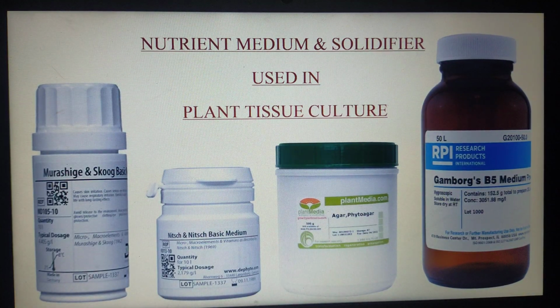And these are the images showing the different types of media. Instead of preparing the medium ourselves, because only a skilled person can prepare the medium at a proper level and in a correct manner, we can collect the medium from the market, and we can simply add it according to the requirement.